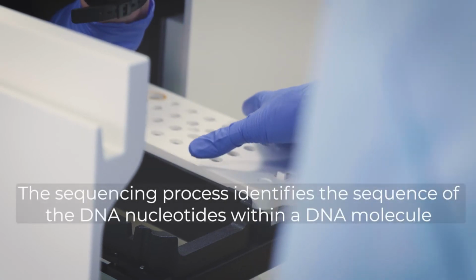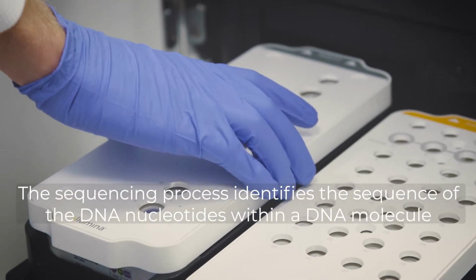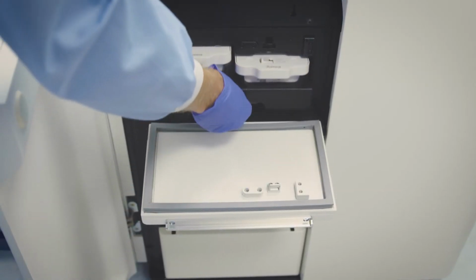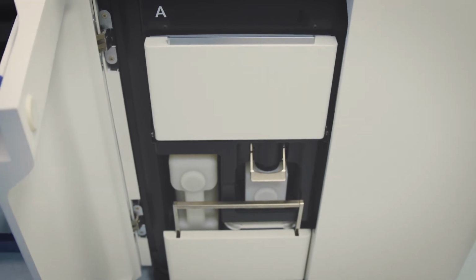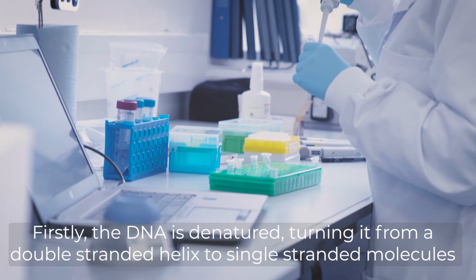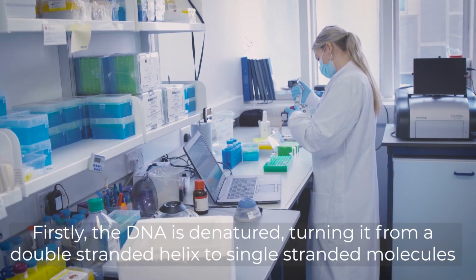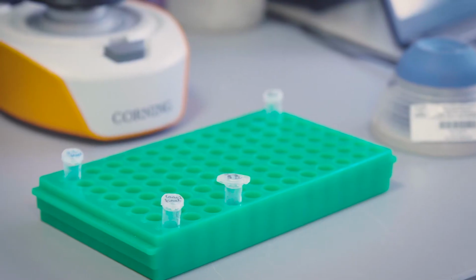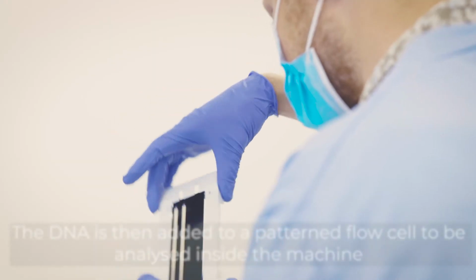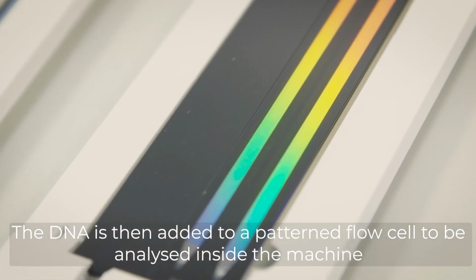The sequencing process identifies the sequence of the DNA nucleotides within a DNA molecule. Firstly, the DNA is denatured, turning it from a double-stranded helix to single-stranded molecules. The DNA is then added to a patterned flow cell to be analysed inside the machine.